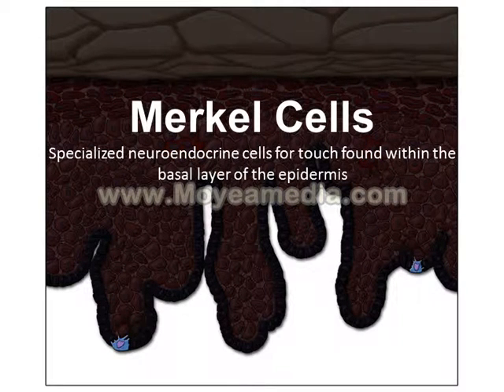Merkel cells present in the basal layer are slow-reacting touch receptors. They're often associated with follicular units and, of course, give rise to Merkel cell carcinoma.